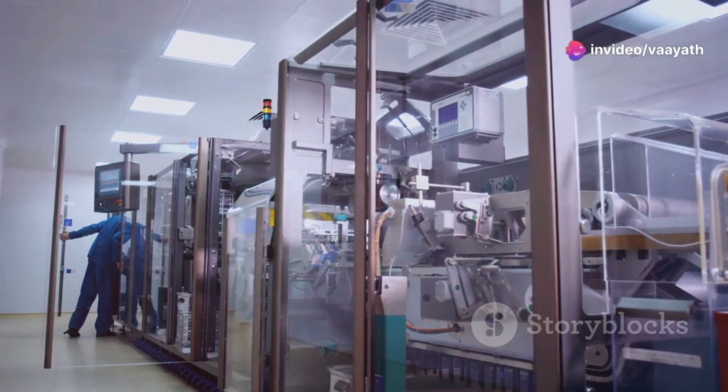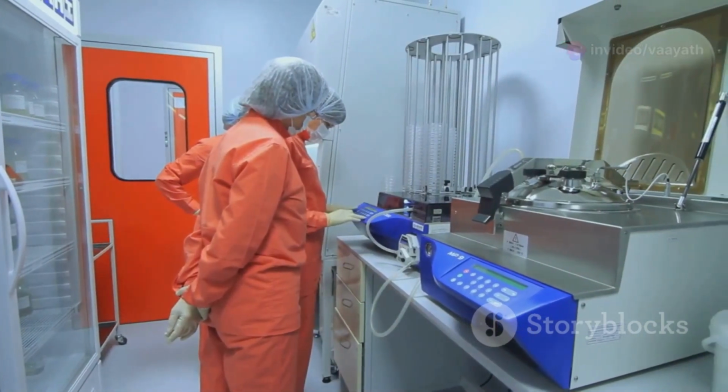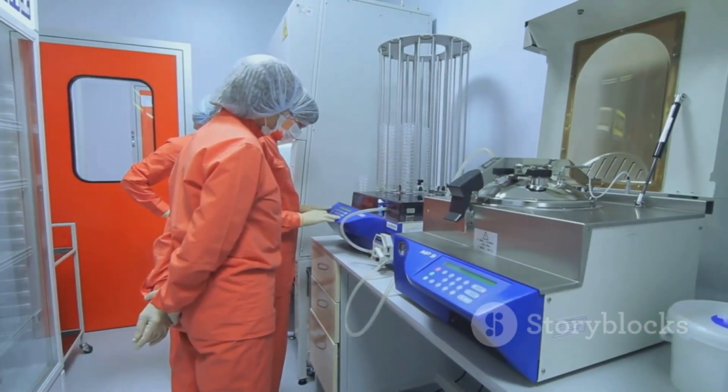Section 10. Real-world examples of media fill success and failure. The importance of media fill validation is best illustrated by real-world examples. A successful media fill program provides confidence in the sterility of manufactured medicines, protecting patients, and upholding public health.